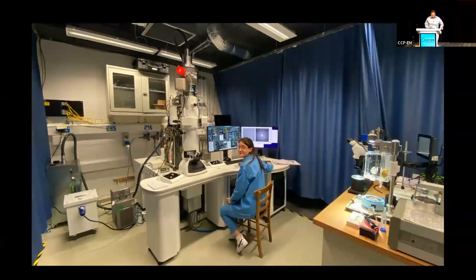So the whole thing has a couple of pumps on here and a gate valve and can be mated on top of a column. And so the other thing we changed was the lens, and I'll show you that in a second. And then here's the Dectris Singla detector, which is one of their first electron cameras that's been designed to attach to a standard electron microscope. And you can see it has a little low-dose interface here, which was written by Greg McMullen, which we use to actually collect our data sets.